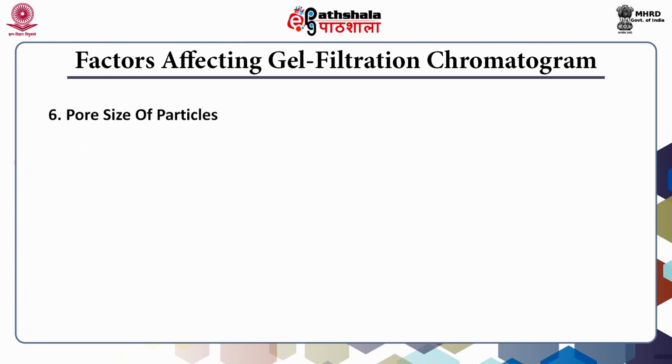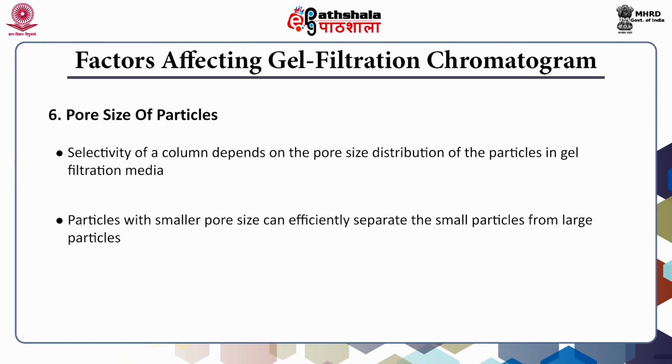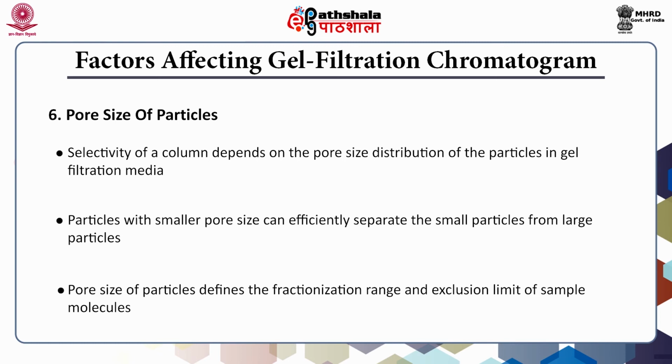Pore size of the particles is another factor affecting the gel filtration chromatogram. The selectivity of the column depends upon the pore size distribution of the particles in the gel filtration media. Particles with smaller pore size, as we discussed in the previous slide, can efficiently separate small molecules from larger molecules. The pore size of particles defines the fractionation range, as we discussed in the exclusion limit. Here we are discussing again that the pore size of the particle defines the fractionation range and exclusion limit of the sample molecules.